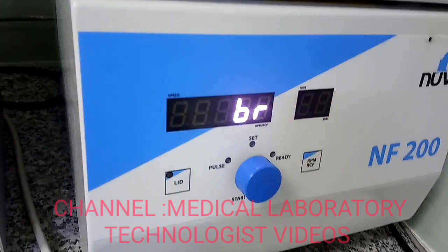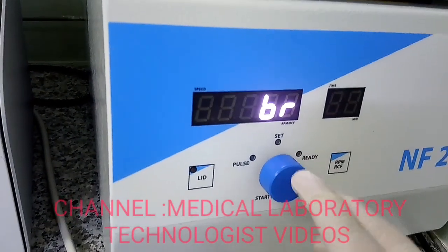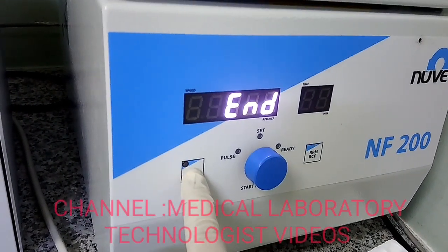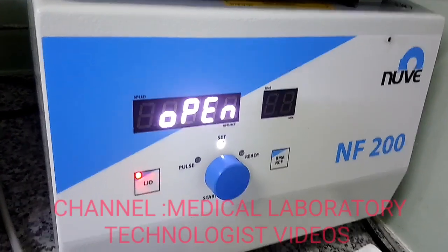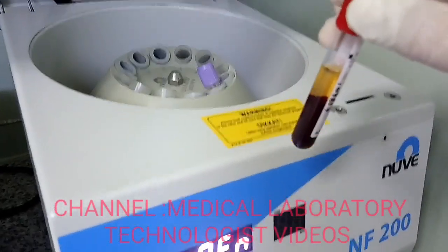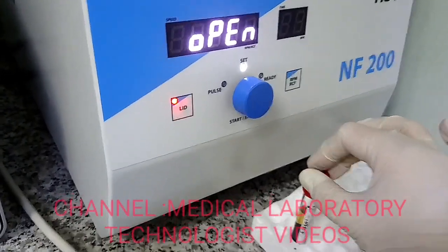One good point of this centrifuge is easy programming — just push and press one button. You can hear the sound indicating the run has ended, so now I will open the lid. You can see the serum is nicely centrifuged. If I need to run again, I would do the same process, but in this case the serum is clearly separated in one centrifugation, so I will not repeat it.